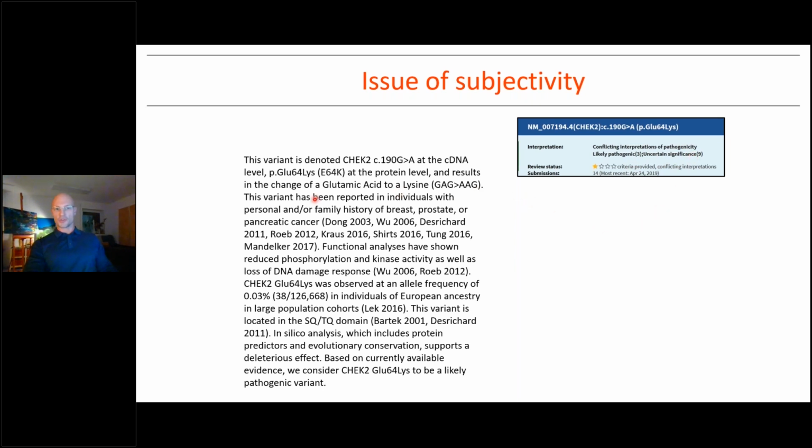And to demonstrate what I want to tell you, this is an extract from one of the big US labs. I don't remember, maybe it was GeneDx or Ambry or Invitae, and they sometimes provide very good summaries or interpretations about the variant.